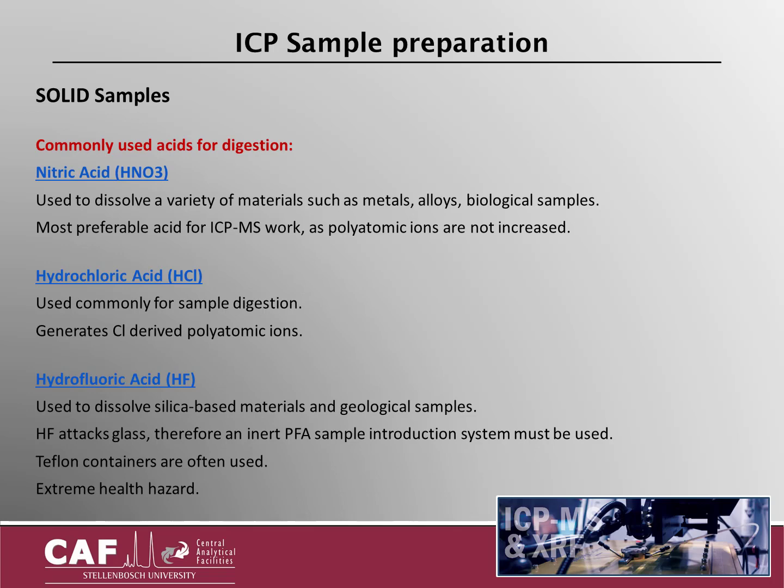In high concentrations, it can generate some interferences into the ICP-MS, so it's not ideal to do digestion only in hydrochloric acid when you've got small sample volumes and you do measurement for trace elements.